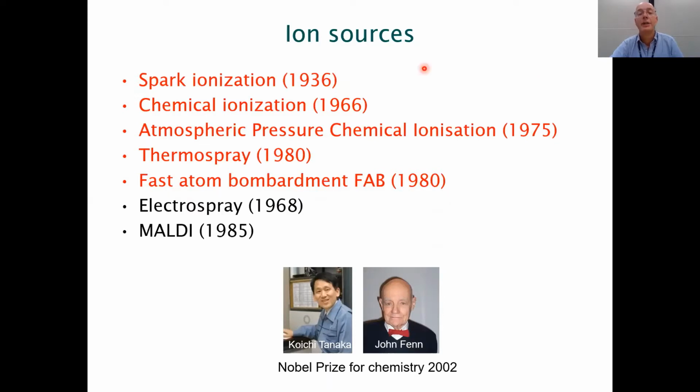The reason for that is I don't really know very much about these ionization techniques, and the reason for that is because I'm a biologist by training, and these I've labeled in red are hard ionization techniques. This means that for a biomolecule like a protein, they will just cause it to disrupt the structure. And these techniques are of no use in general in biology.